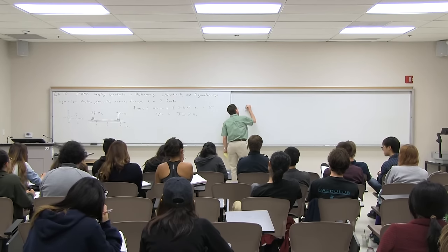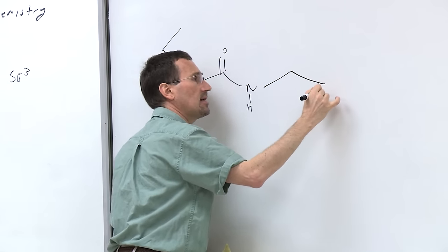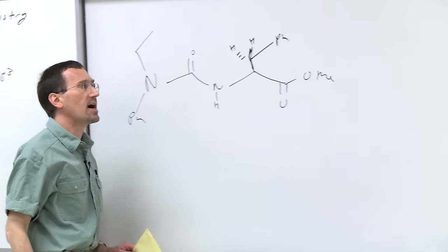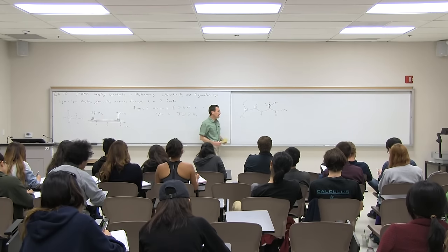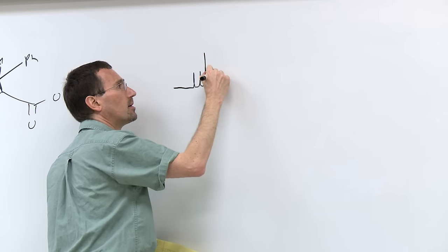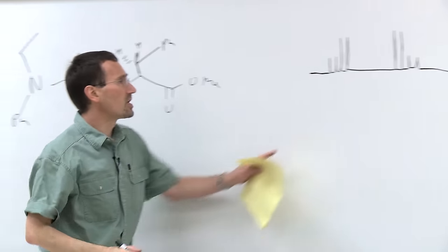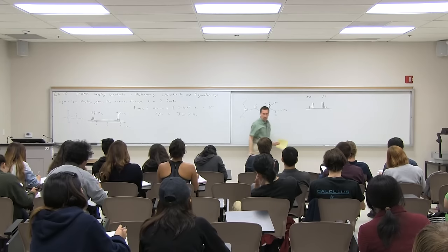The example that we looked at in class was this derivative of phenylalanine. And I put up a handout, an actual spectrum of the phenylalanine derivative. And we looked specifically at the two diastereotopic protons. And we saw a pattern for each of them that was a doublet of doublets in an ABX pattern. We saw the pattern line, line, line, line, line, line, line, line, where one proton gives rise to one doublet of doublets, DD. The other gives rise to another doublet of doublets.